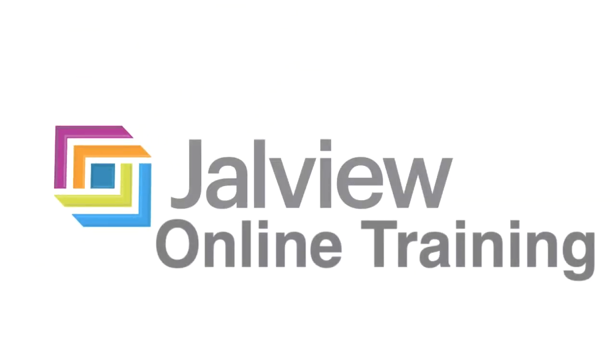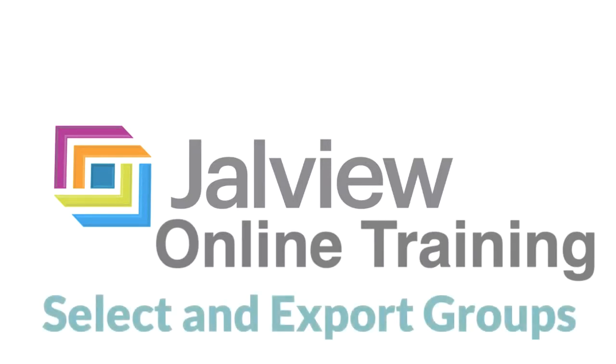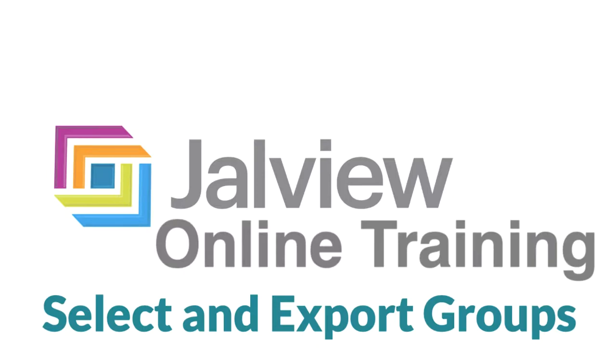In this Jalview Online training video I will be demonstrating how to select a group within your sequence alignment and how to export the selection.